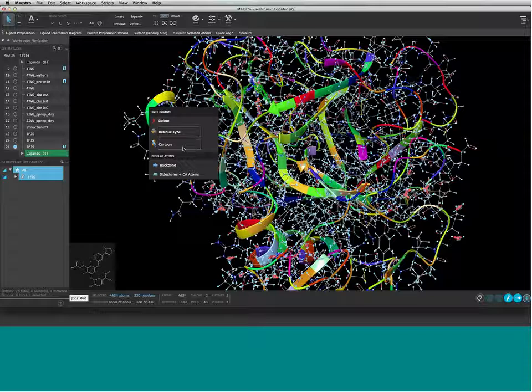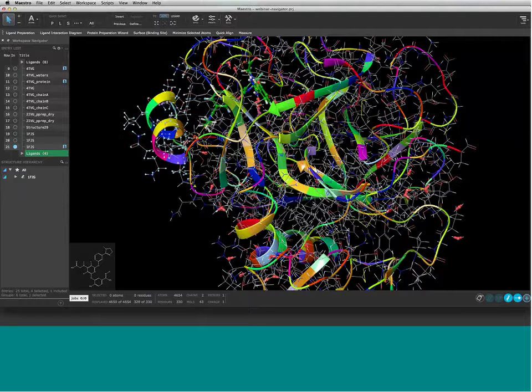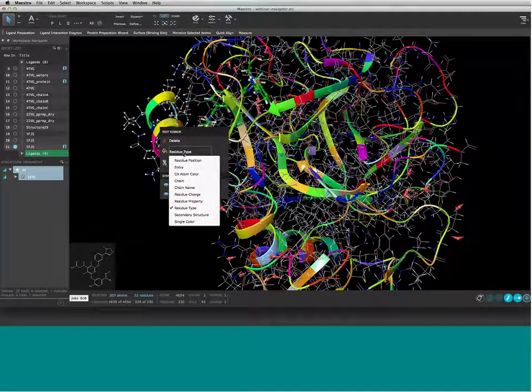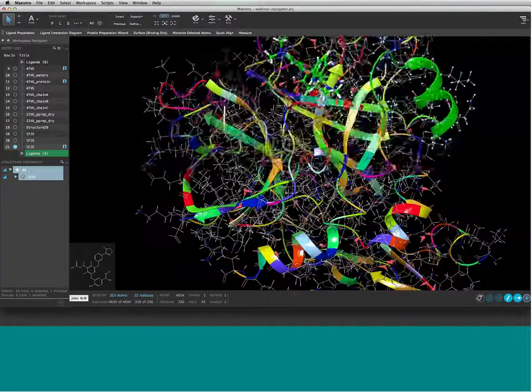And if you have just a particular set of residues selected, then right-clicking will only affect those. So if you want to change those to green, for example, or delete them, you can basically build up substructures of the ribbon, right-click, and change particular colors as needed.